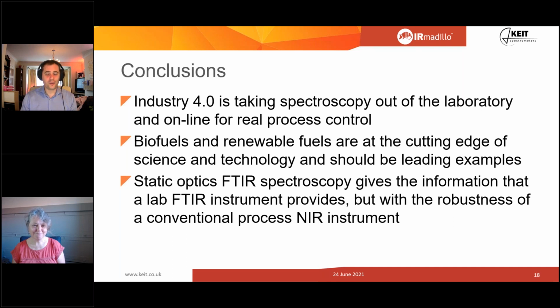So I looked at it first ab initio, looked at just the spectra, and ended up coming to the conclusion for them that they were 75% of the way through it, but not quite finished because they hadn't taken into account their transition states. And they had transition states they could never analyze because the second they took a sample offline, it disappeared. And it's only by looking at it online that you could see it. As a result, they now leave the reaction for an hour and a half and they get much better yields. So yes, that kind of thing.